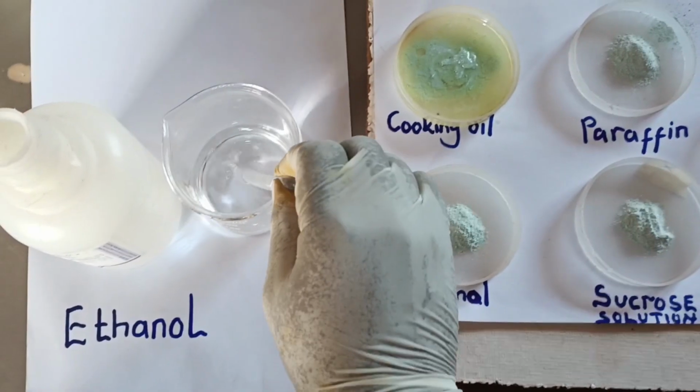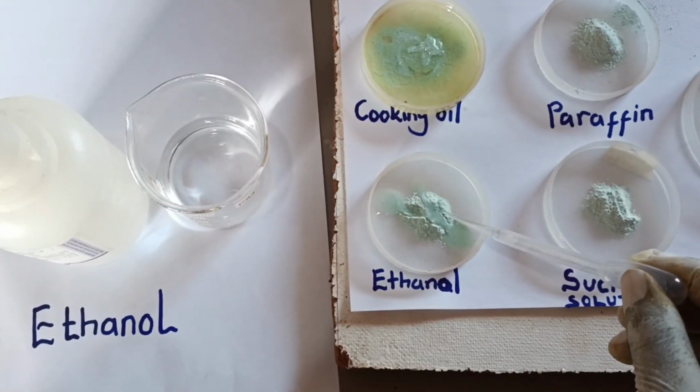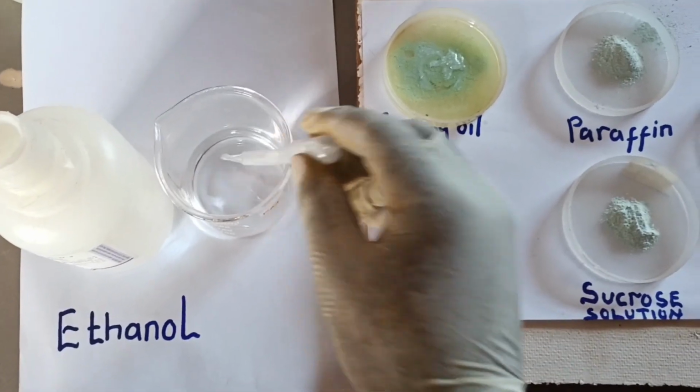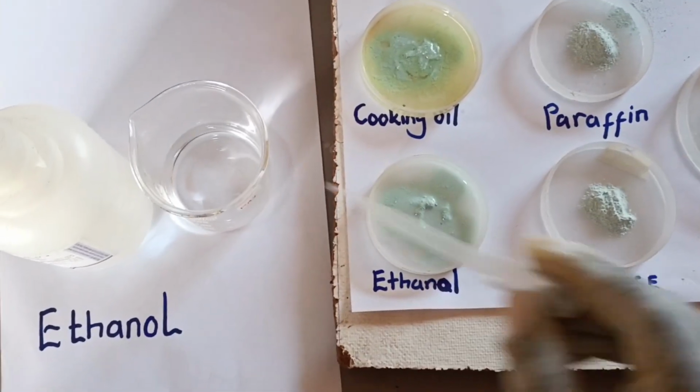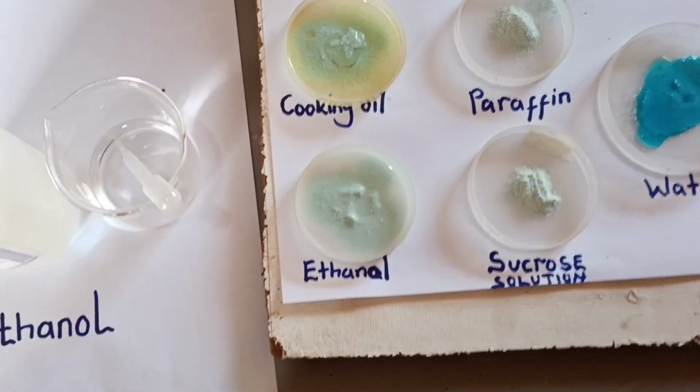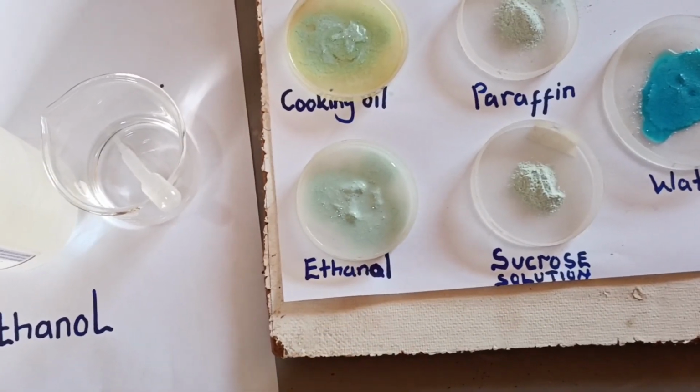Next, we are adding pure ethanol on anhydrous copper 2 sulfate. The color of anhydrous copper 2 sulfate remained. This implies that in pure ethanol, there is no trace of water in it.